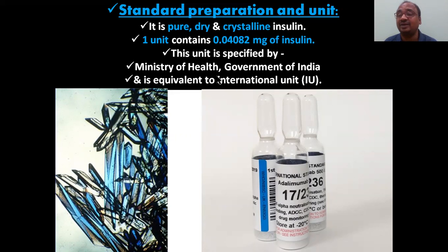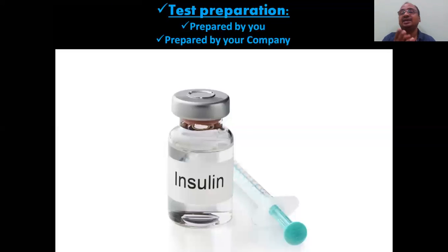This unit is specified not by me, it is specified by the Ministry of Health, Government of India. It is equivalent to the international unit, so we are preparing to the international standard. This is a test preparation. What you have prepared in your laboratory, isolated from animal insulin, we are labeling as a local insulin.